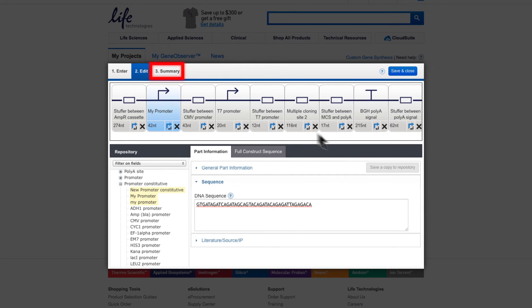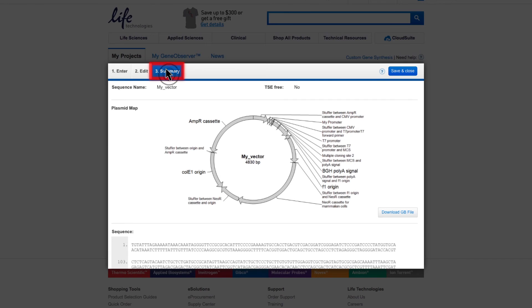Switching to the Summary tab gives you a graphical display of the vector you constructed. You can also review the vector sequence directly or download a .gb file.